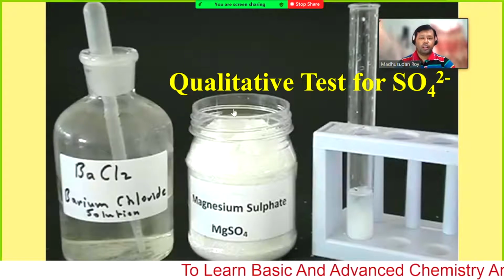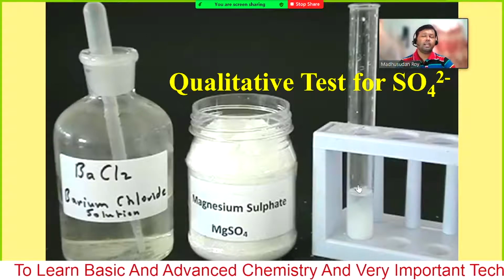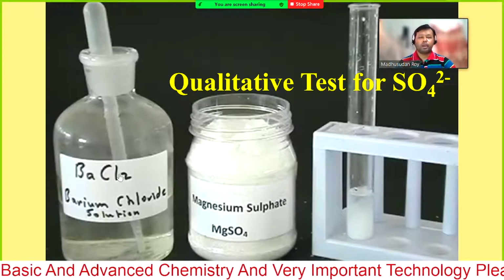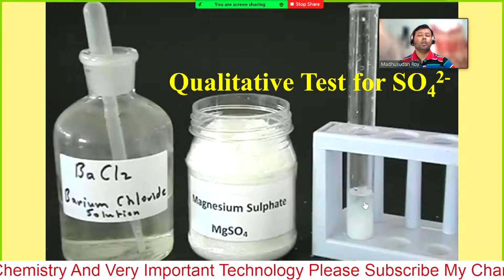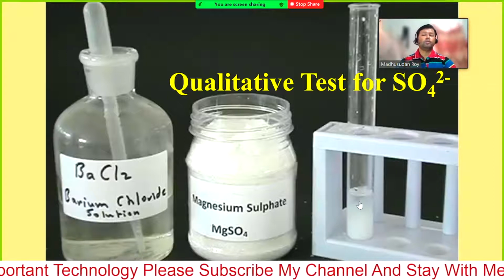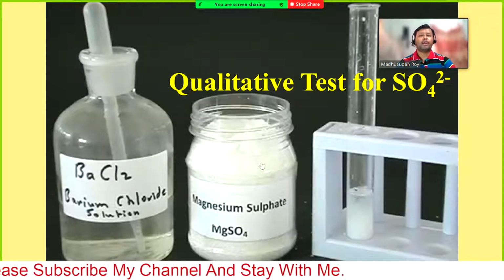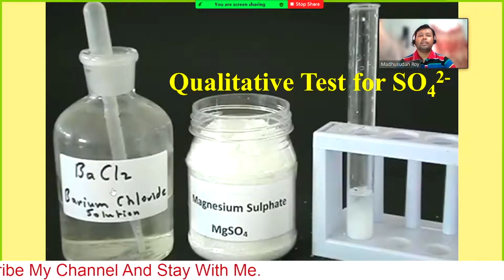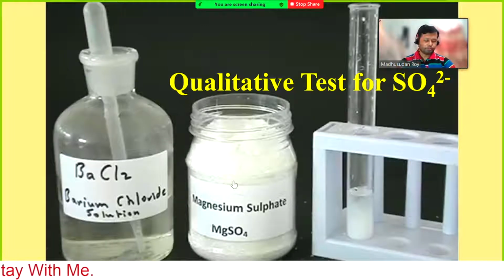For any sulfate test confirmation, just dissolve in water and then add a couple of drops of barium chloride to the clear solution, and you will observe a white precipitation like this. If you have this observation, white precipitation of barium sulfate after addition of barium chloride, then you can confirm the presence of sulfate in your sample.